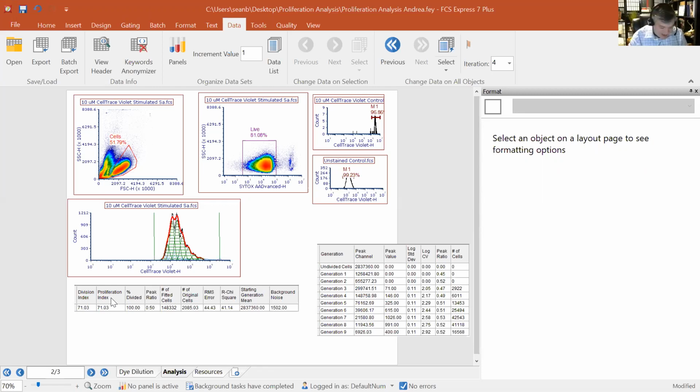But in the end, a lot of the time when people publish with this stuff, they make some sort of reference to a publication that gives the mathematical formula for what it actually means. So again, these are technically challenging assays to run, but it is important to go back, look in our manual, and get some more information about the mathematics behind what these mean as well.